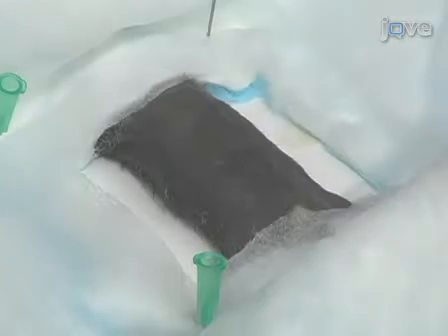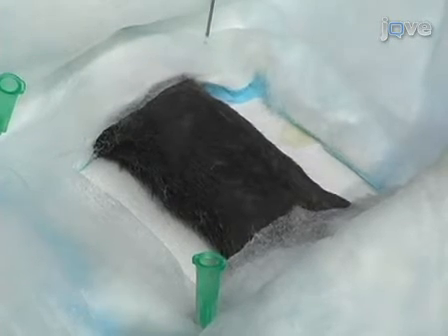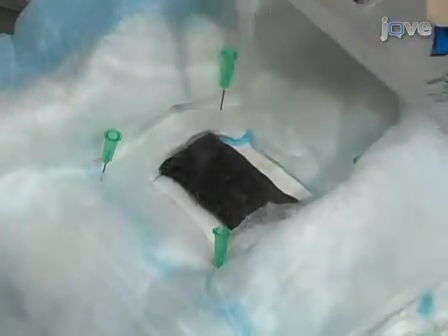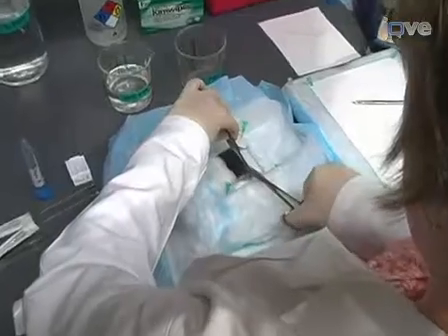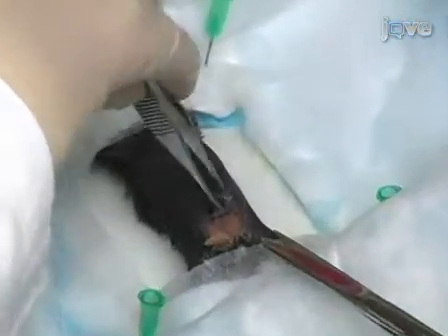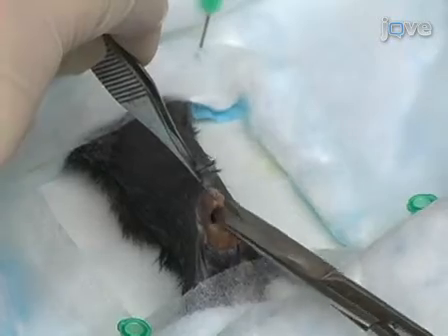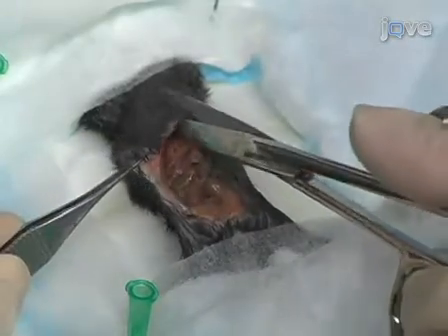To harvest the colon, expose the ventral side of the euthanized mouse to ensure unobstructed access to the abdomen. Wet the abdomen completely with 70% ethanol. Grasp the midline of the abdomen with tissue forceps and elevate, thus tenting the skin. Using fine-tipped scissors, incise the abdomen to expose the abdominal contents. Extend the incision to the tip of the xiphoid process at the midline, and then extend along the inferior aspect of the costal margins bilaterally.